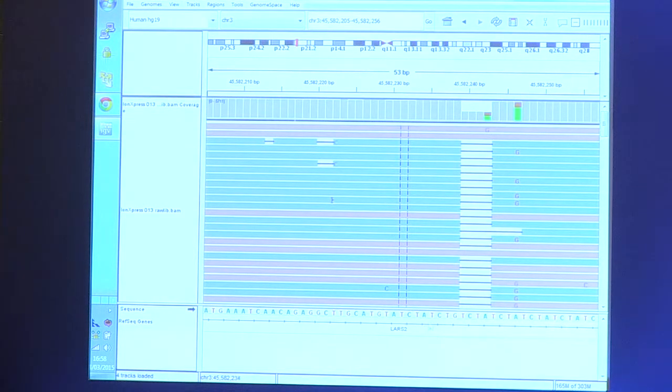If you're not familiar with IGV, you'll see the bases across the bottom here represent the reference, and then these bars up the top here represent our reads that we achieved in the sequencing run. Now the different colors reflect the different directions of sequencing, so forward and reverse, and you'll see maybe the most striking factor is that almost all of them are missing a 4-base stretch in here, but this is simply that the specific person that we have sequenced has got one fewer STR repeat than the reference.